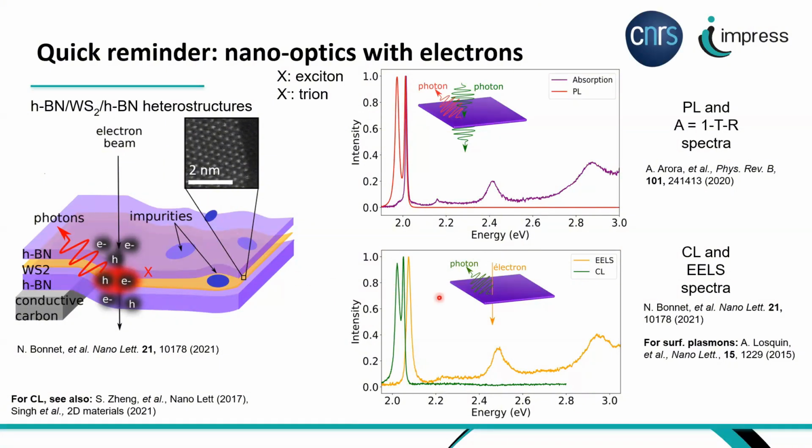And what we wanted to show is that we can, using EELS, which is in orange at the bottom, measure the same excitonic transitions. If you want, we can discuss afterwards exactly what we are measuring in this experiment, but we can see these different excitonic transitions that are also measured using optical absorption. So we have basically the same information that's measured with optical absorption, but with nanometer spatial resolution.